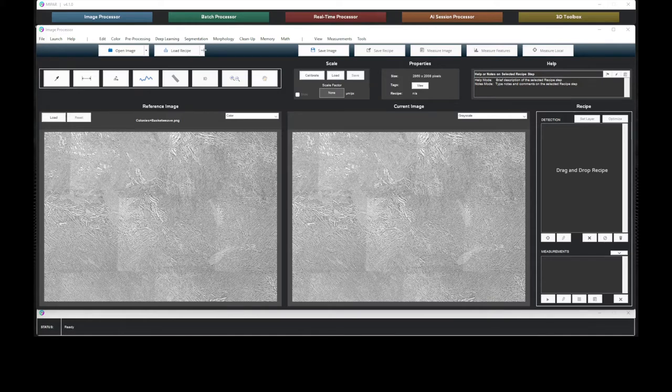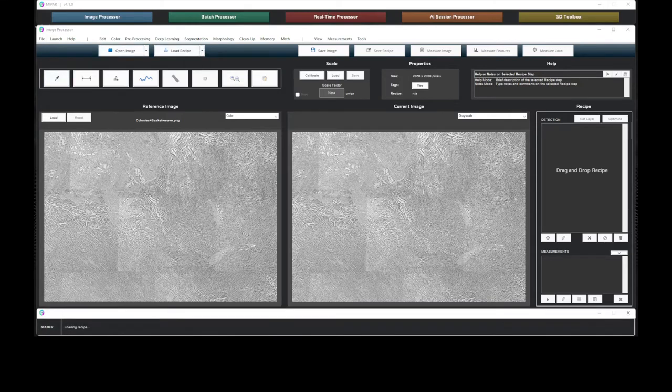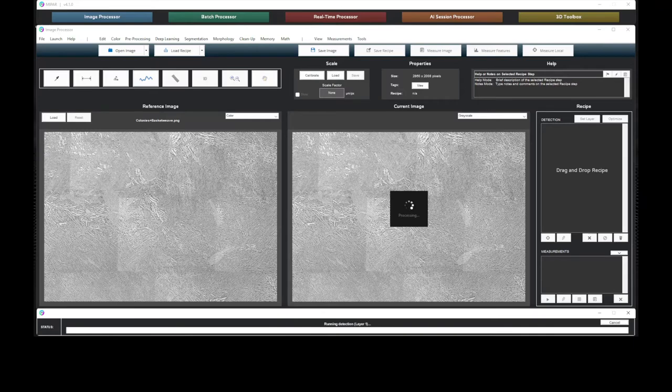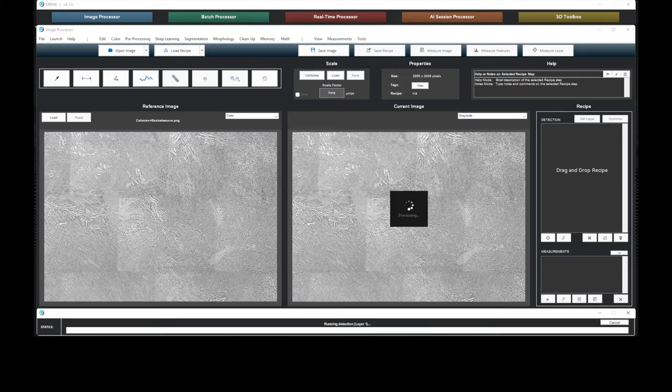As we apply the recipe, we see MIPAR has been able to teach a deep learning model how to differentiate between the two microstructures to obtain an accurate characterization of this titanium alloy sample.